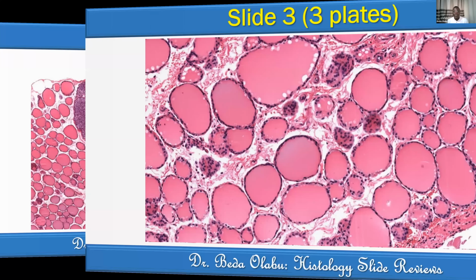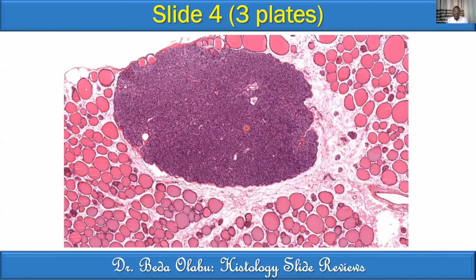Slide number 4. So this is the lowest magnification. This is the field of the slide, but we are focusing on this structure here. So that is that magnification. I hope you've written down what is standing out for you.